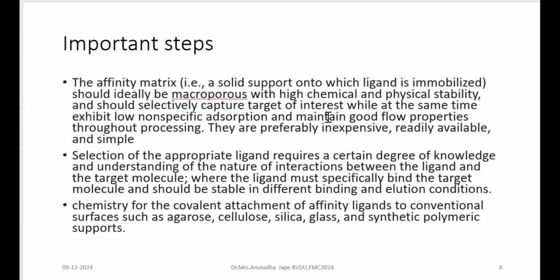So you have to have basic knowledge of the interactions between the ligand and the target molecule, so that the ligand must specifically bind with the target molecule. If the active sites or functional groups of the ligand interact with the support matrix, they will not remain open for the target molecule to attach with, right? And for this you need to know basic chemistry.